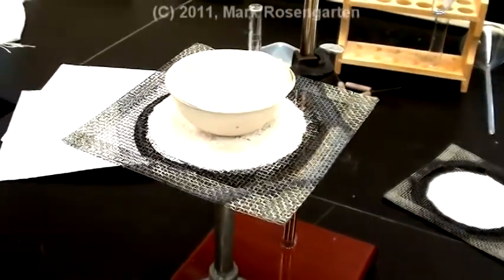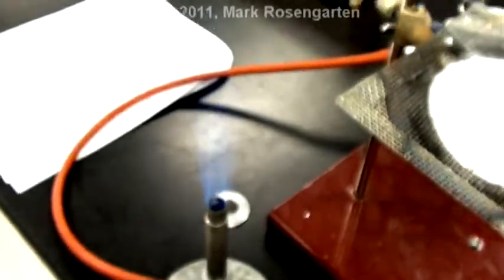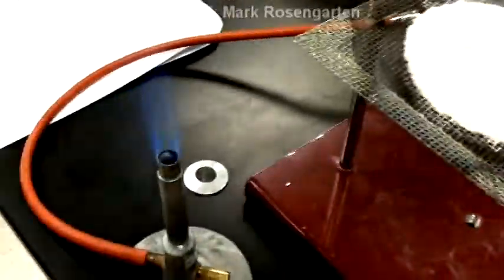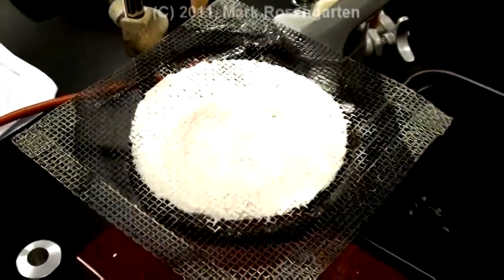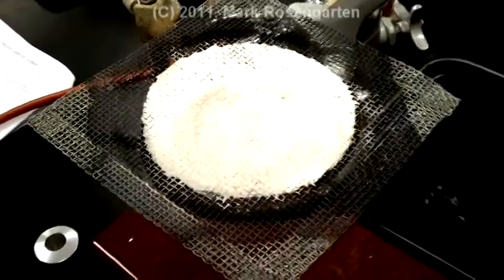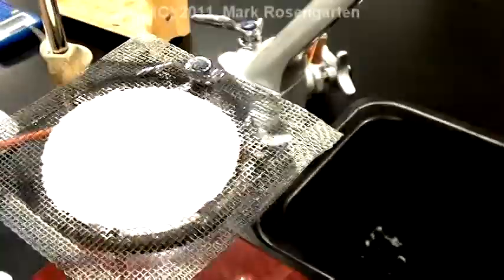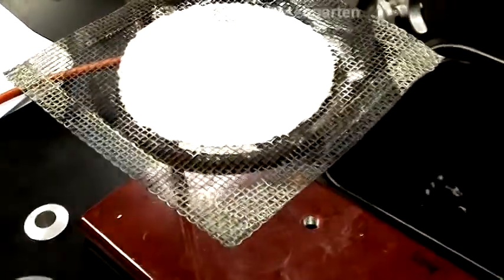This will evaporate away the water and leave behind the sodium nitrate which was once dissolved. Notice how the burner is lit yet there is nothing to heat it up on. If you place the burner under and then try to place the thing on it, you will burn your hand very badly. The suggestion would be: simply place your dish with the watch glass on top of it on top of the wire gauze and then move the Bunsen burner into position.